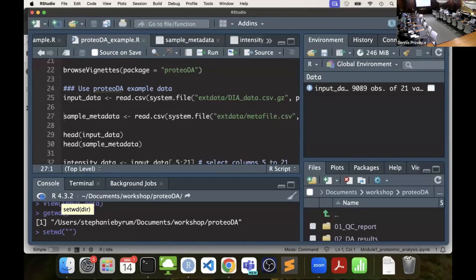And for Windows, it's different. For Mac, you're doing it like this, but for Windows, things are different. So I'll give you an example. I'll send it to you because the slashes get backwards between Windows directories and Linux, because we can't keep anything the same. God, everything is dependent on your environment.